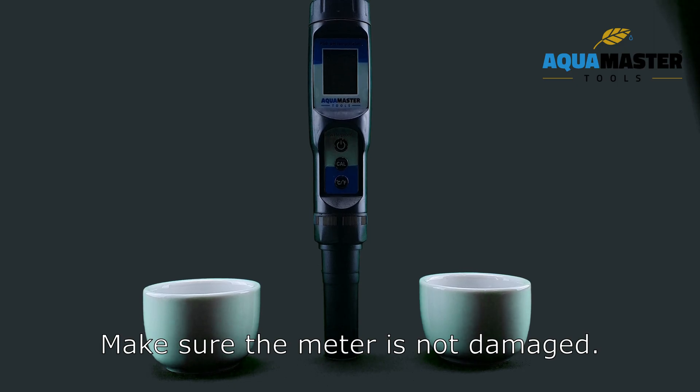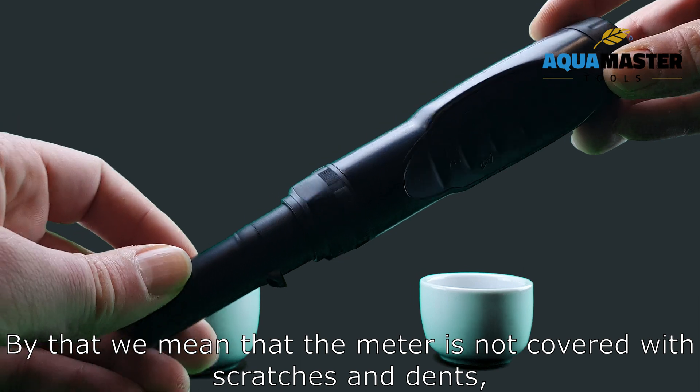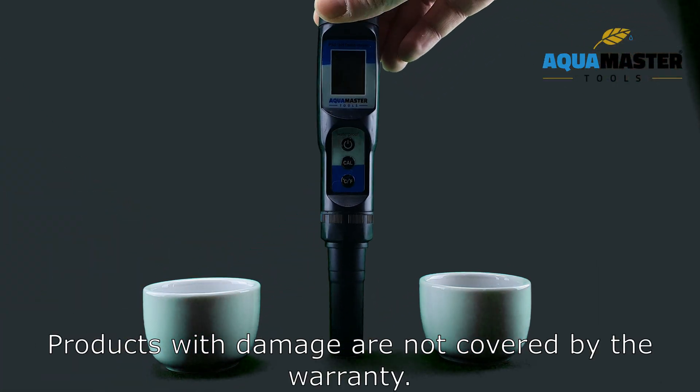Make sure that the meter is not damaged. By that we mean that the meter is not covered with scratches and dents, or full of soil and other pollution. Products with damage are not covered by the warranty.